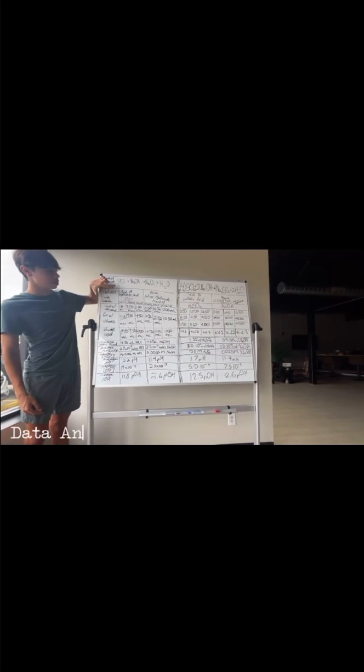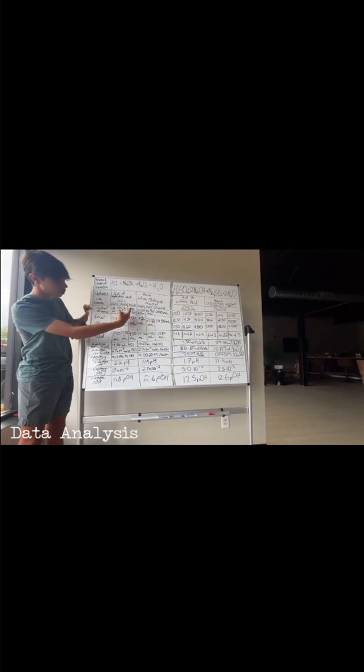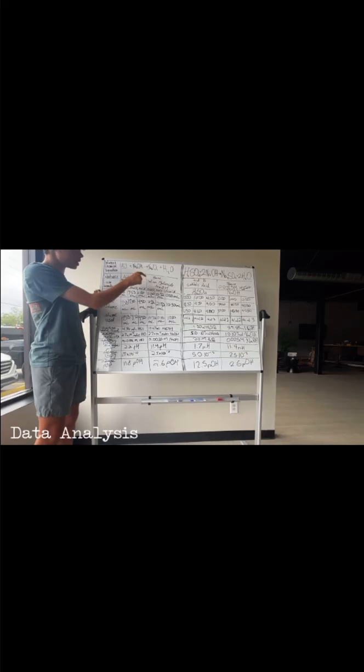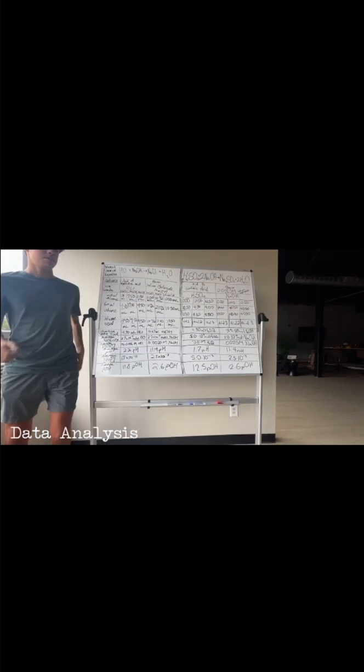This is acid A, hydrochloric acid, which is stomach acid. This is our chemical equation and the chemical formula. This is our initial volume for 3 trials. This was the final volume, the volume used, and then we averaged it to get that number. For the base, we did the same: initial volume, final volume, volume used, and that was our average number for base used.